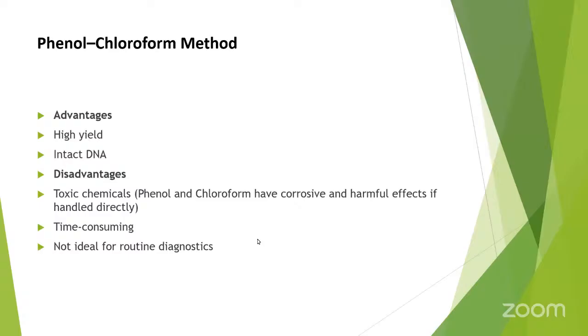Phenol chloroform method. This method has some advantages and disadvantages. Two advantages of this phenol chloroform method are that it gives a high yield of DNA, and the DNA stays intact.